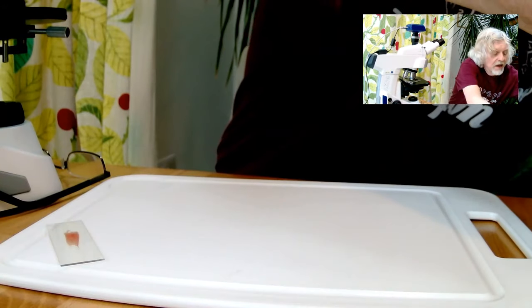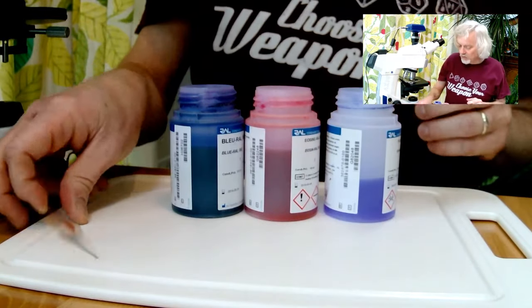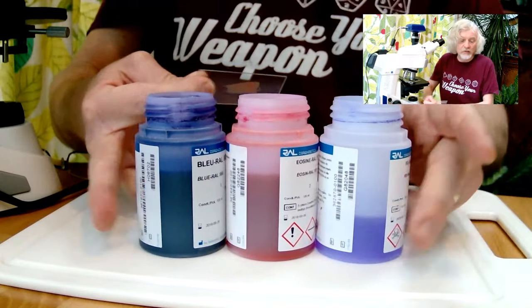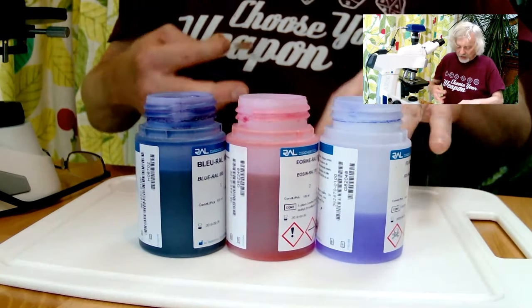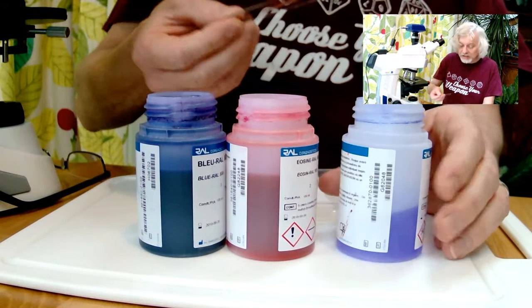Okay. And to stain them up, I have to use these three chemicals here. Now, the process, I'm going to do it first, and then I'm going to talk you through afterwards. I'm going to tell you what I've done so that I can just get on with it, so to speak. So the first thing I have to do is dunk it in this chemical here. This one is methanol.